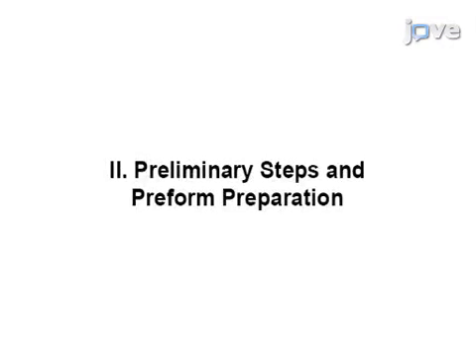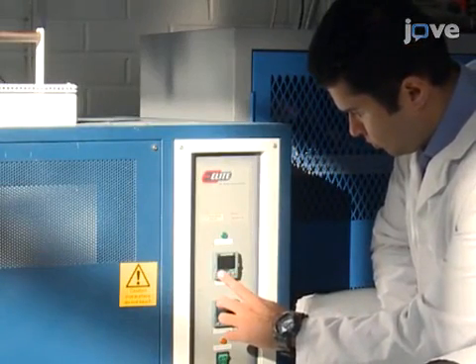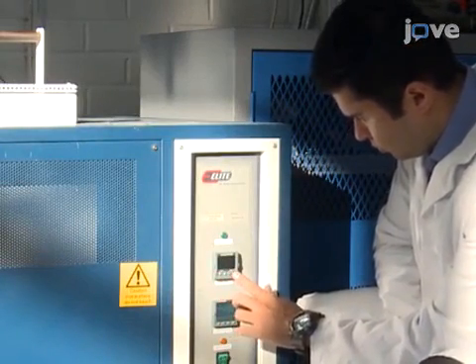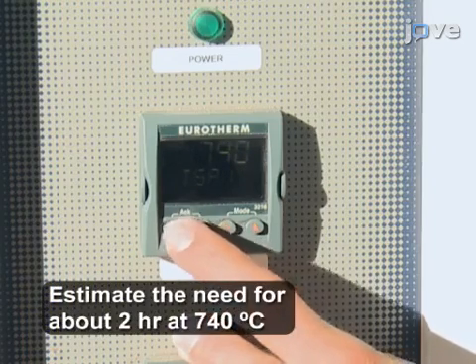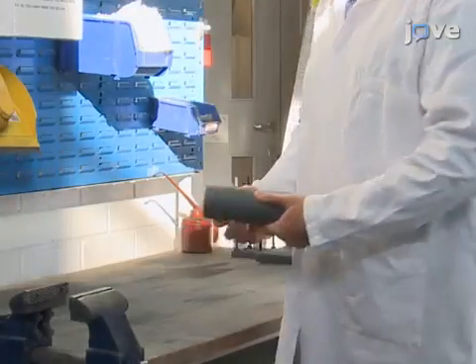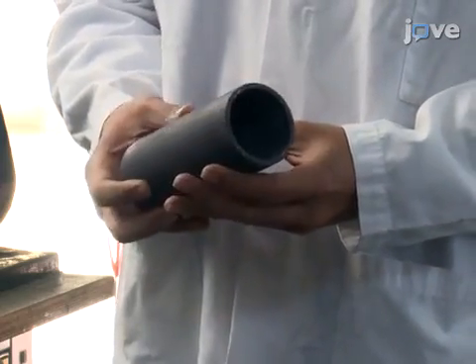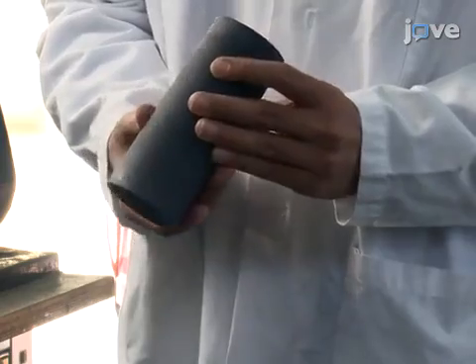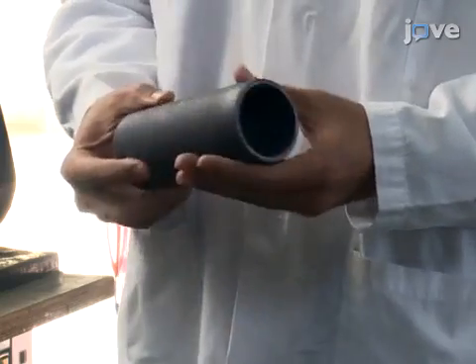As a first step, set the furnace to increase 20 degrees Celsius per minute to a final temperature of 740 degrees Celsius. As it is reaching its final temperature, begin preparation of the preform. The preform will be placed in a mold; in this experiment the mold is cylindrical, 150 millimeters tall, with an inner diameter of 51 millimeters.